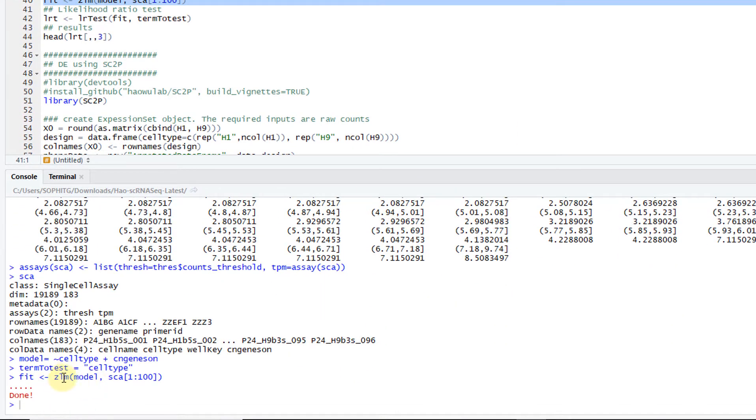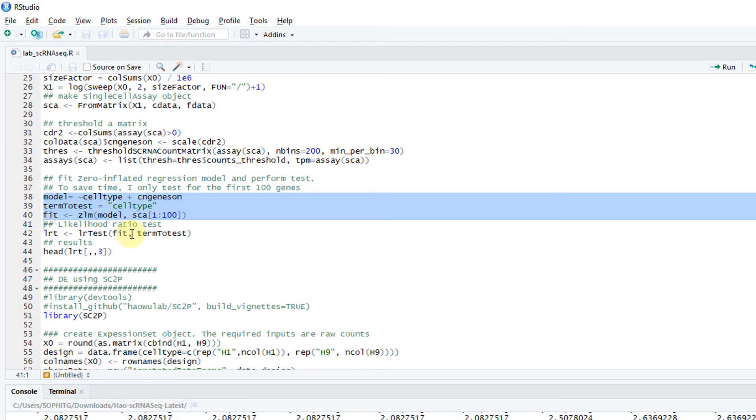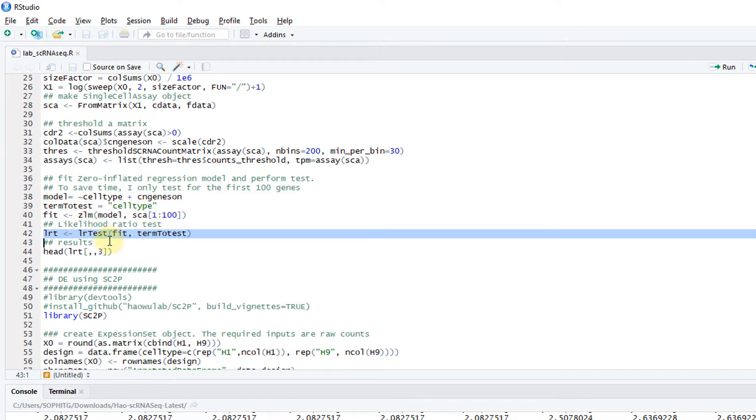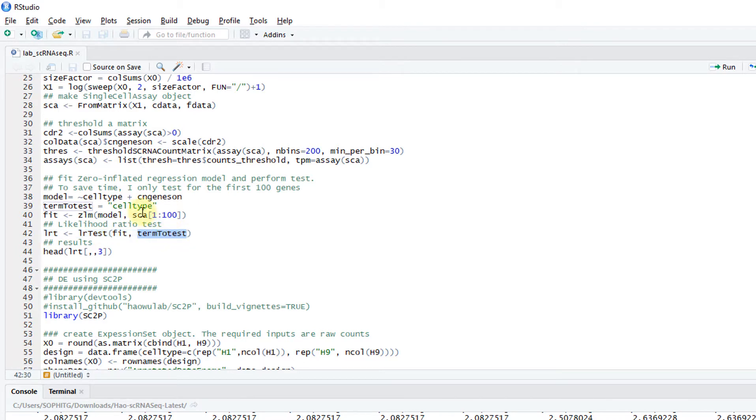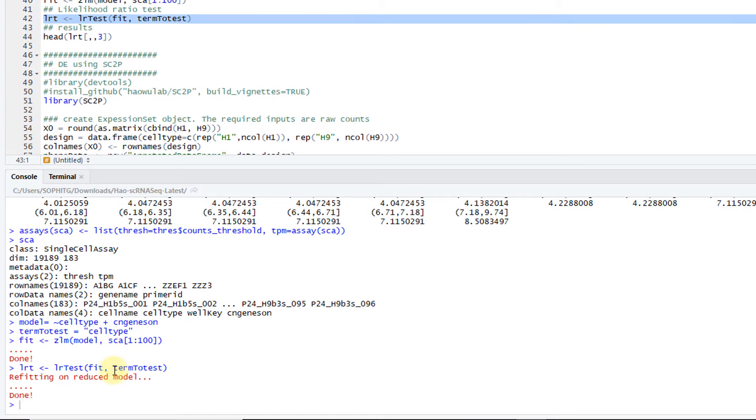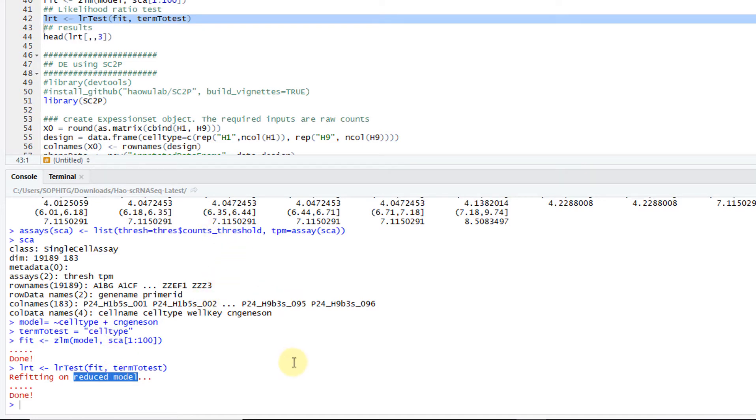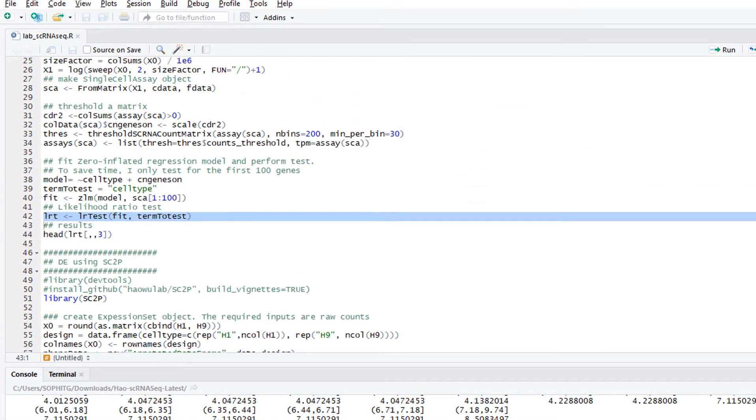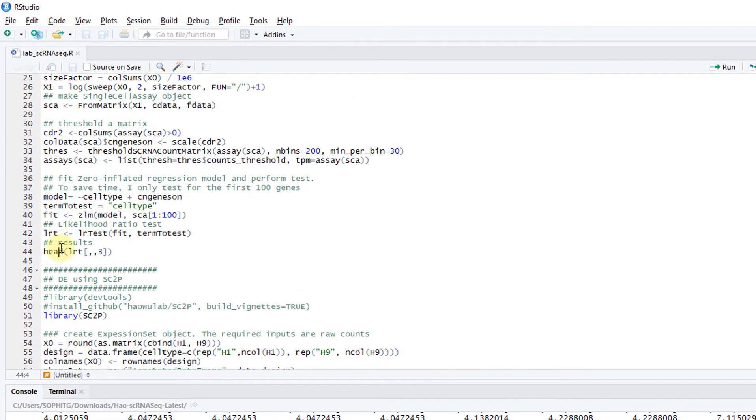Basically this fits the zero inflated Poisson model. Then I can do a likelihood ratio test. Here's my fitting result. Here's the term to test. This is cell type. It's a likelihood ratio test, basically a reduced model. It drops the cell type from your model and refits the model, then does a likelihood ratio test. Here's the result.